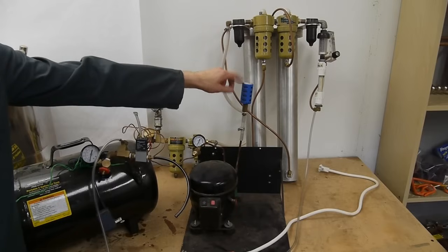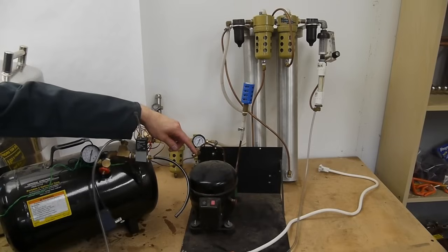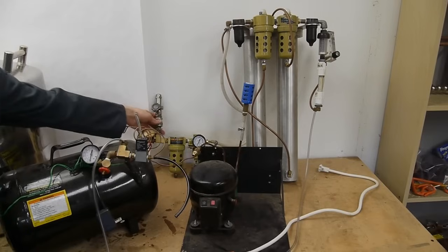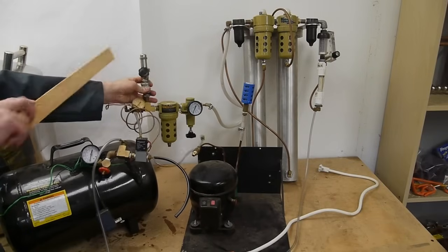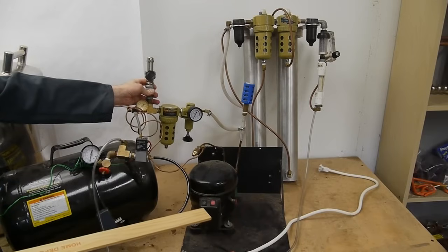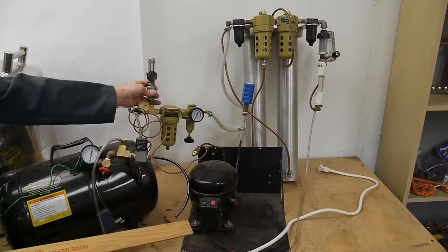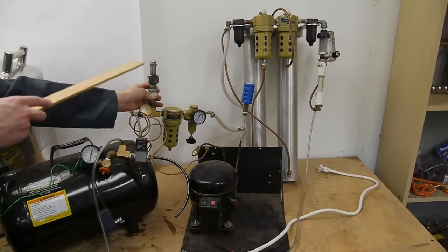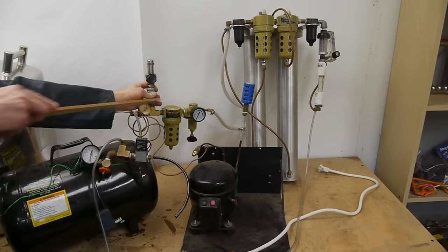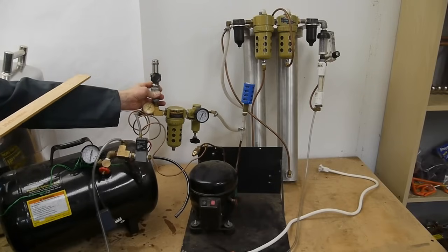The inlet is here with a filter to filter out large dust particles and then the high pressure air which is wet and filled with oil from the compressor comes out here and goes through this setup. There's a pressure release valve since this compressor doesn't have it's not easy to turn it on and off and if it's under pressure it doesn't like to start. So I had a spring loaded relief valve to keep the pressure constant going into this whole system probably about 100 psi or 120 or something like that.